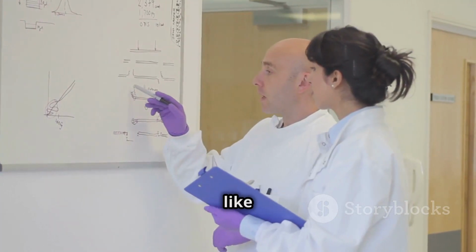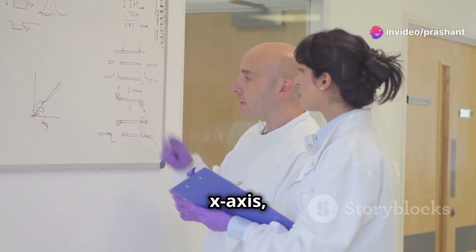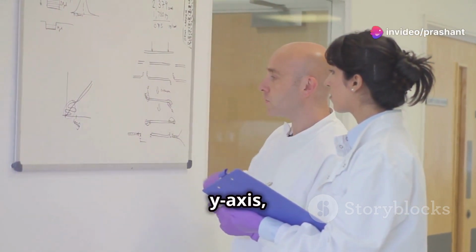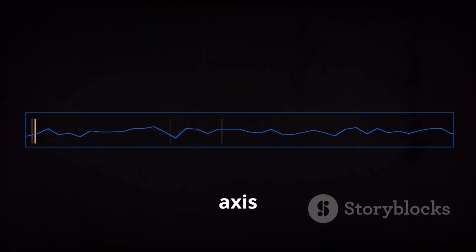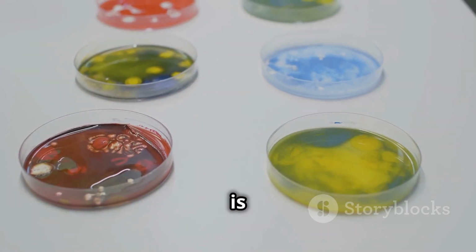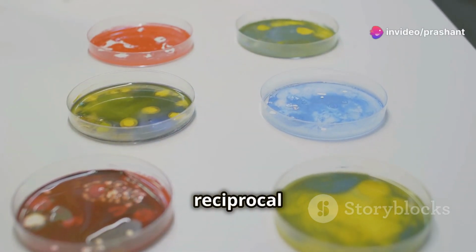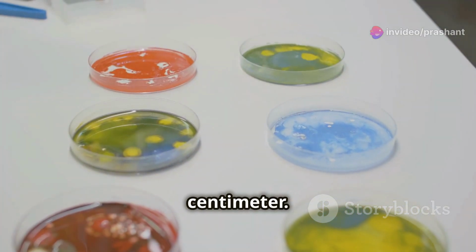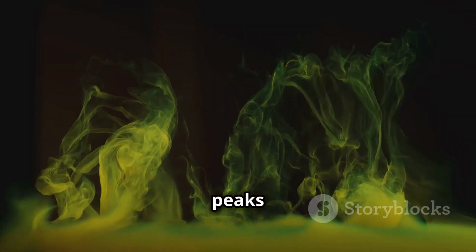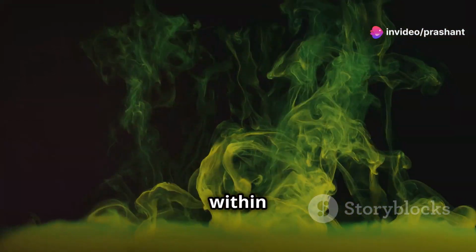An IR spectrum is like a graph with two axes. The horizontal axis, also known as the x-axis, and the vertical axis, or y-axis, each provide crucial information about the sample being analyzed. The horizontal axis represents the wave number, which is inversely proportional to the wavelength of light. Wave number is measured in reciprocal centimeters, cm⁻¹, and indicates the number of wave cycles per centimeter. The higher the wave number, the higher the energy of the light. This means that peaks appearing at higher wave numbers correspond to higher energy vibrations within the molecule.